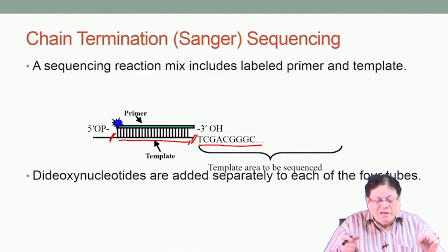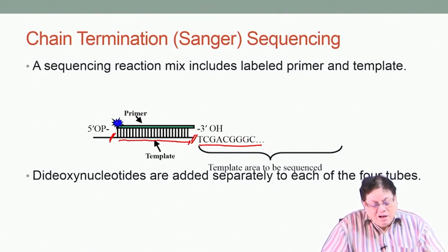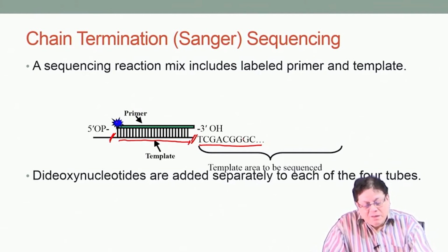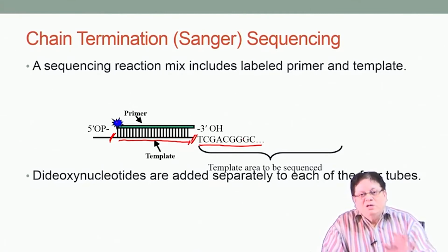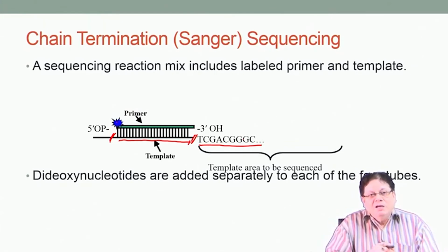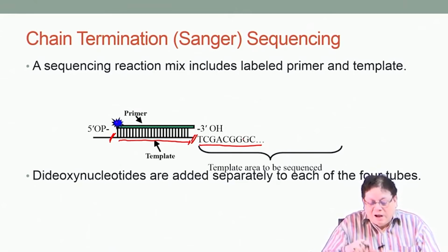So, you need a tag which will ultimately act to determine the nucleotides that are truncated. You may not understand right now, once I give the example it will be very clear. This radioactivity is needed to know which nucleotides are truncated by taking the dideoxy nucleoside triphosphates.